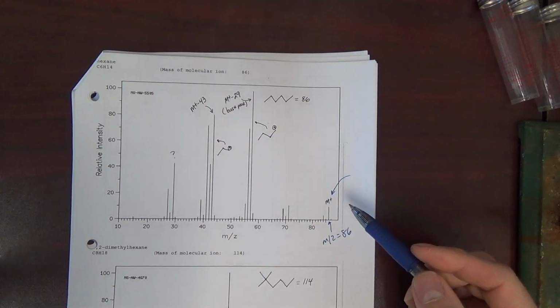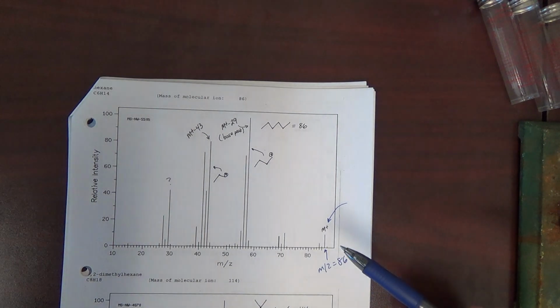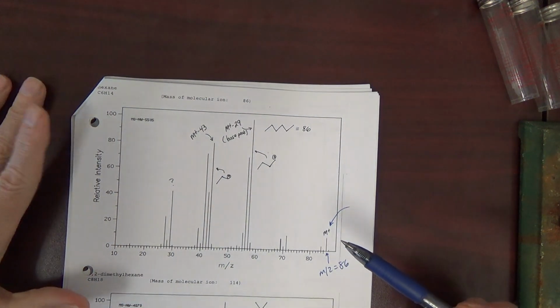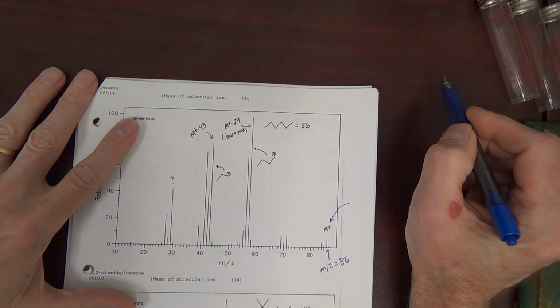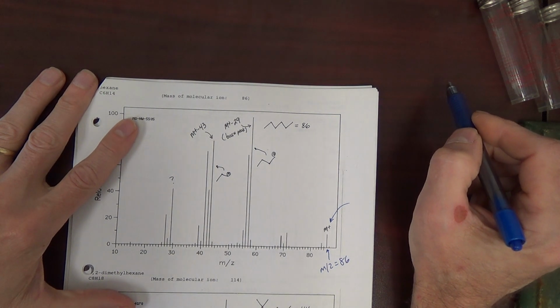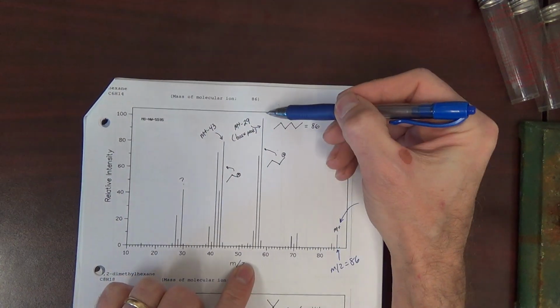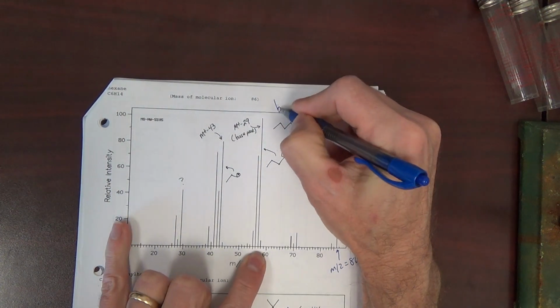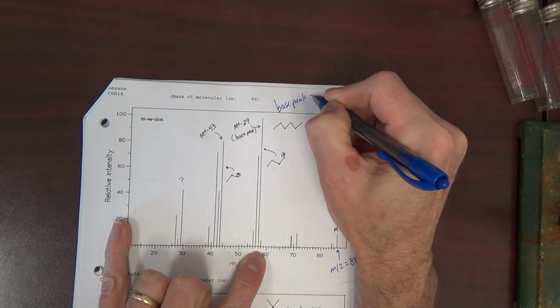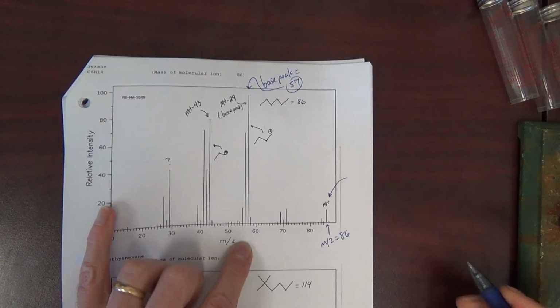Okay, what type of fragments do we expect from hexane? Well, this is a tough molecule to predict fragments. Anywhere you cleave here, it's always going to be a primary cation, not resonance stabilized. For example, first off, the base peak is here. The base peak is what? 1, 2, 3, 4, 5, 6, 7. Base peak equals 57. Okay? m/z 57. See, here's your x-axis.